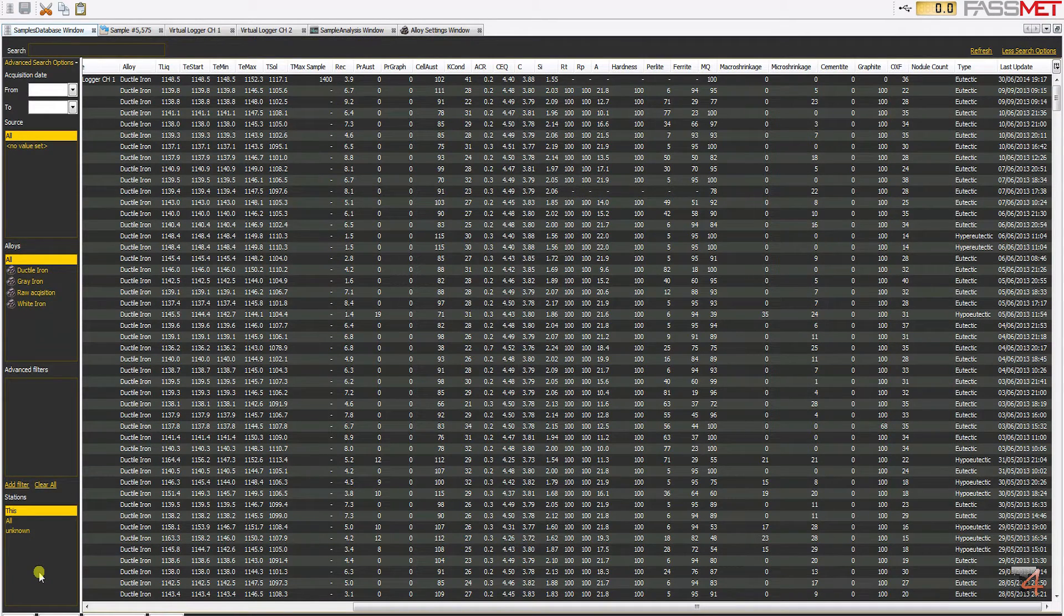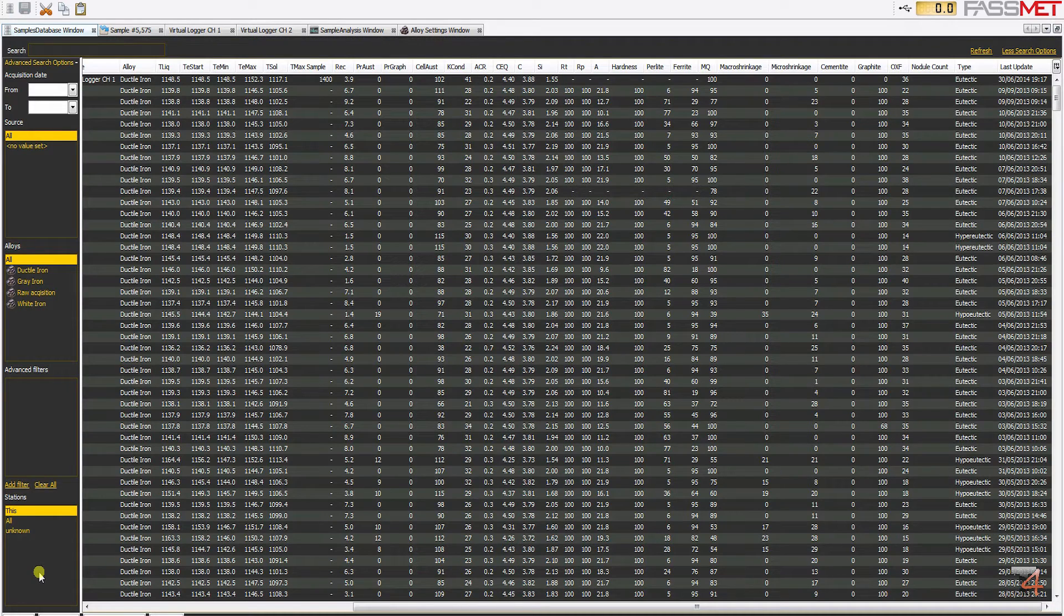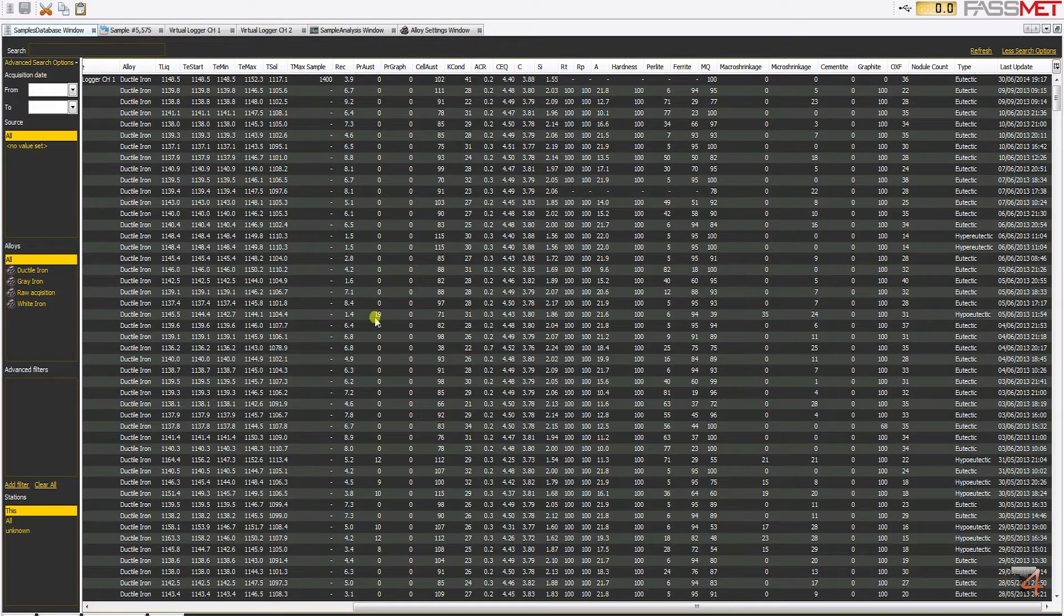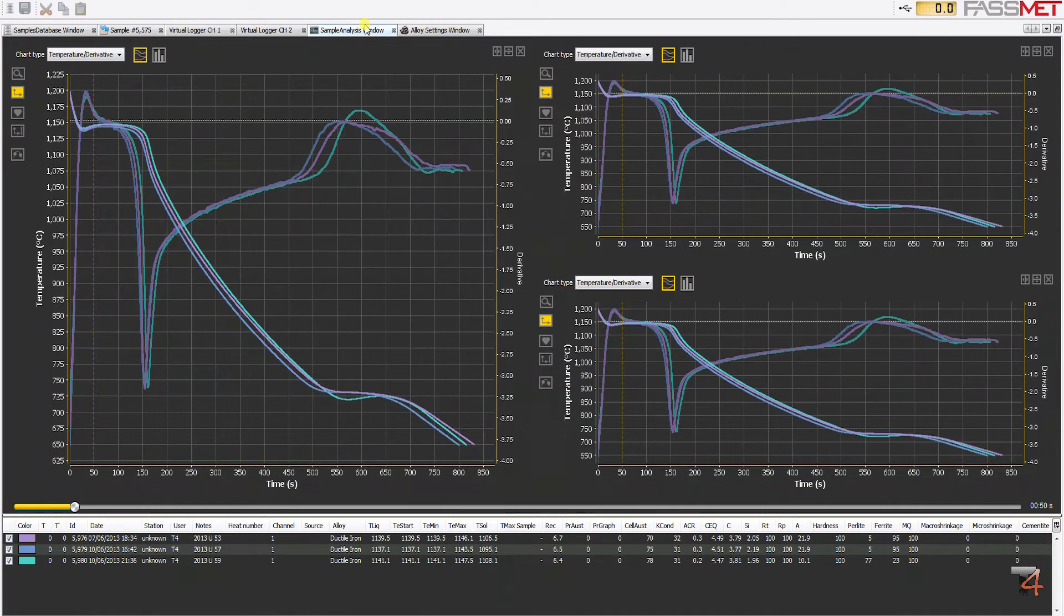Researches can be conducted simply by choosing the criteria from the advanced search options bar. Moreover, multiple samples can be easily selected and compared.